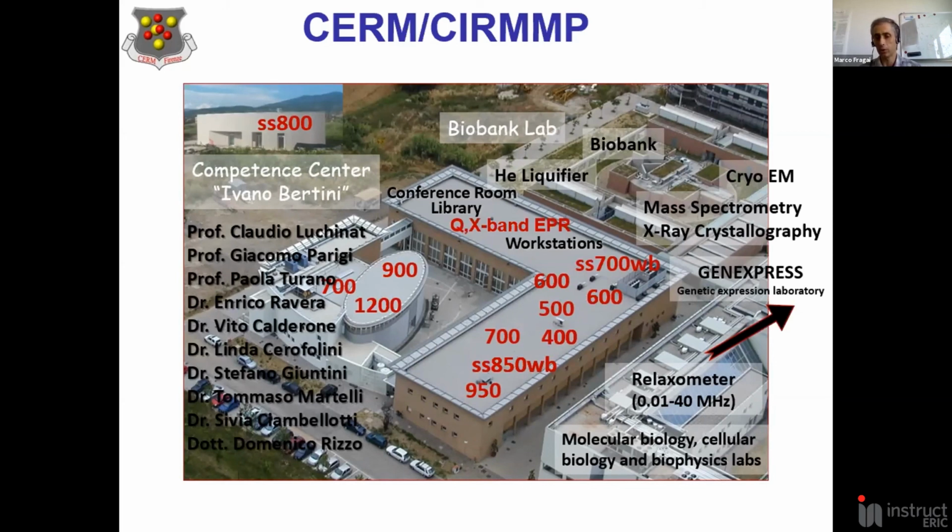We have used proton-based experiments for the crystalline sample and also for the PEGylated sample. So they are really very important for the assignment of the resonances.